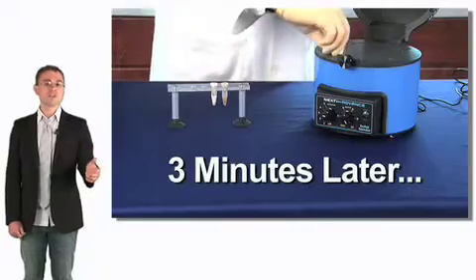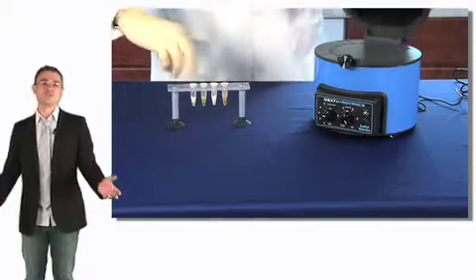More time and a higher speed is for tougher samples, less time and a lower speed for softer samples.